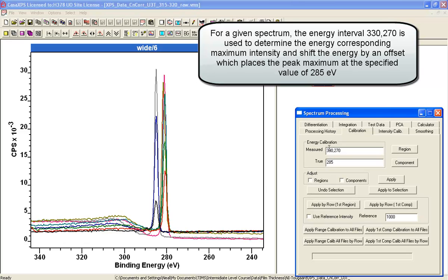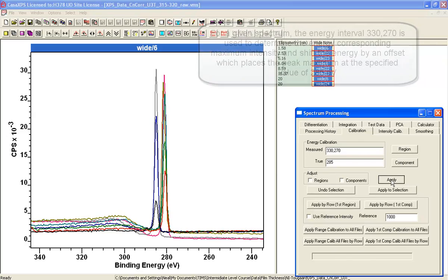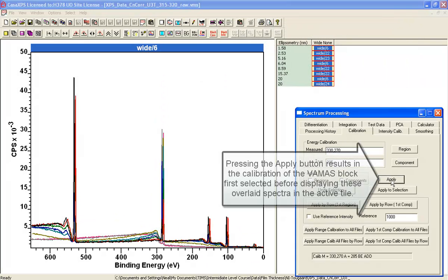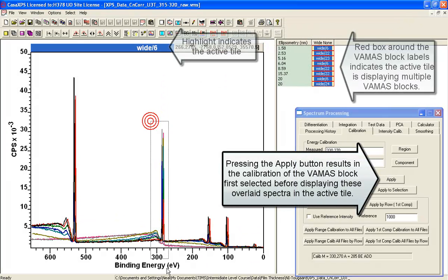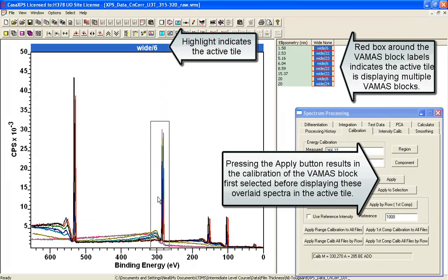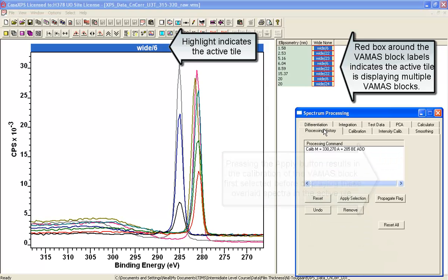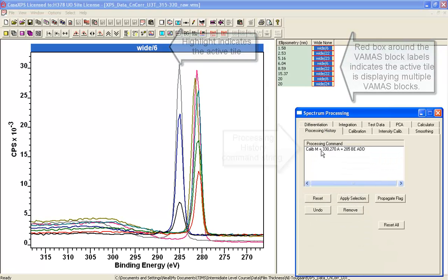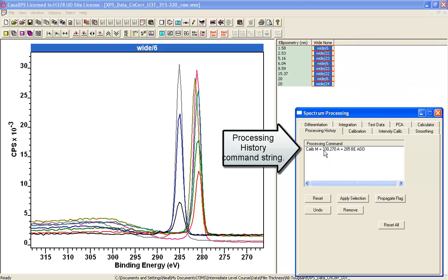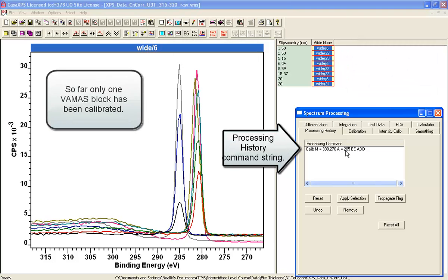Then it's going to calculate from this set of intensities in the interval as specified the peak maximum. And when I say apply, this is going to apply to the first VAMAS block displayed in the active tile. So one of these has been assigned an instruction that tells it to calculate the peak in an interval and assign the peak maximum 285.